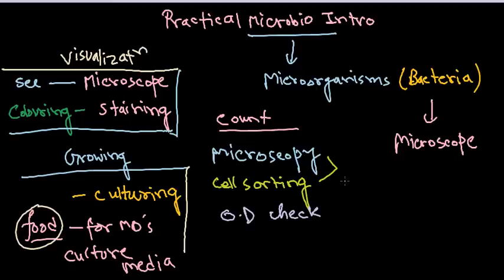That's the most challenging part of microbiology, culturing bacteria and other microorganisms in the lab. For that reason, you need to sterilize certain things before starting this process. You need to sterilize each and every material that is going to contact directly with your culture media or your desired microorganism. So sterilization, I must write here, is another very important stage for microbiology and any kind of culturing process, whether it's a microbiology culture or cell culture of animal cells and whatever. Sterilization is probably one of the most important things you should take care of before even visualizing and growing them, because sterilization comes first.